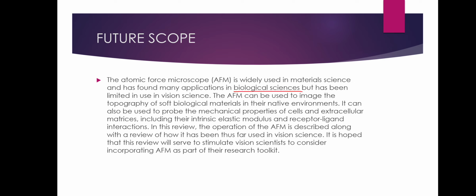But it has been limited in use in vision science. The AFM can be used to image topography of soft biological materials. It can also form the topographic image of biological matter in its native environment and probe the mechanical properties of extracellular matter. So AFM has many purposes, as it can see cells, atoms, and many biochemical samples.